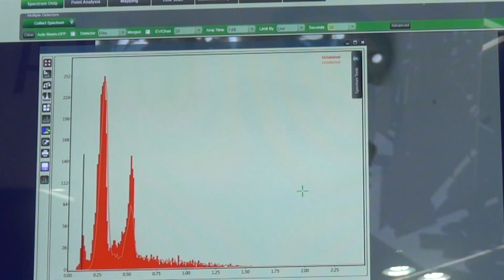And as you might also have noticed, right now I'm only getting about 400 counts per second. Before I had several thousand. Because we're reducing the energy of the electrons coming down, we're reducing the number of X-rays each electron can generate, which has a severe effect on our count rates. So down here, every single count you can get matters. You want to get your detector close in to actually capture everything. And if you're trying to look at lines that are lower, then moving down to L lines becomes possible.